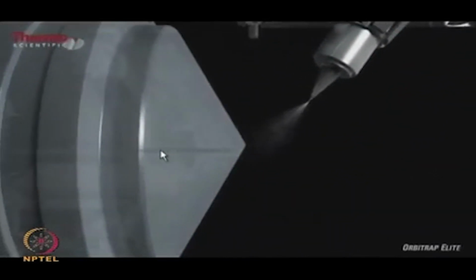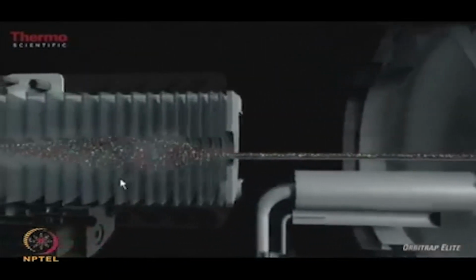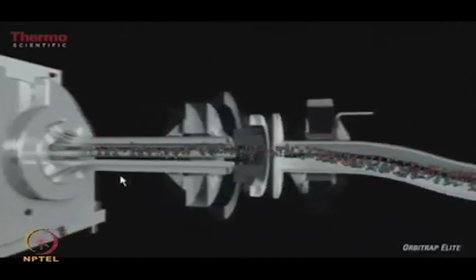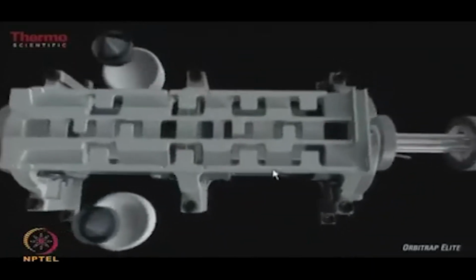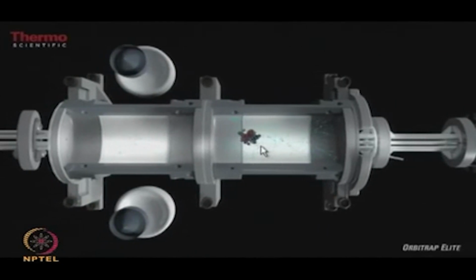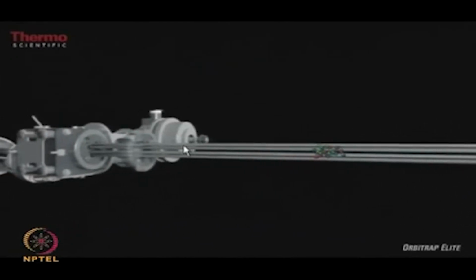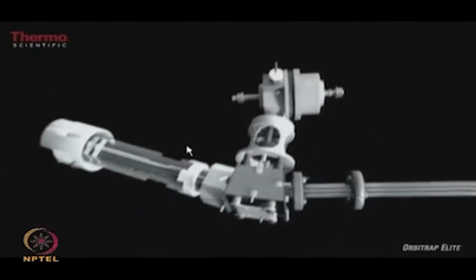So coming back to the ionization source, the ions generated from the source go into the transfer optics, and after going out from the transfer optics they go to the linear trap. In the linear trap, in full scan mode, the ions are stored in the high pressure cell. Once these ions are stored in the high pressure cell in full scan mode, they are transferred to the C trap through the ion transfer optics. Then they go into the C trap.